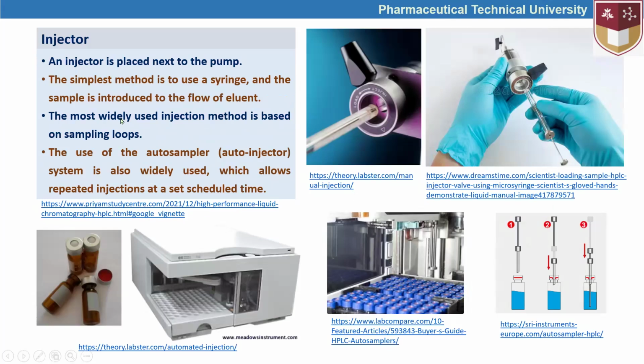And injectors are the second most significant components of the HPLC. By using the injector, we can send these samples as indicated in these figures.